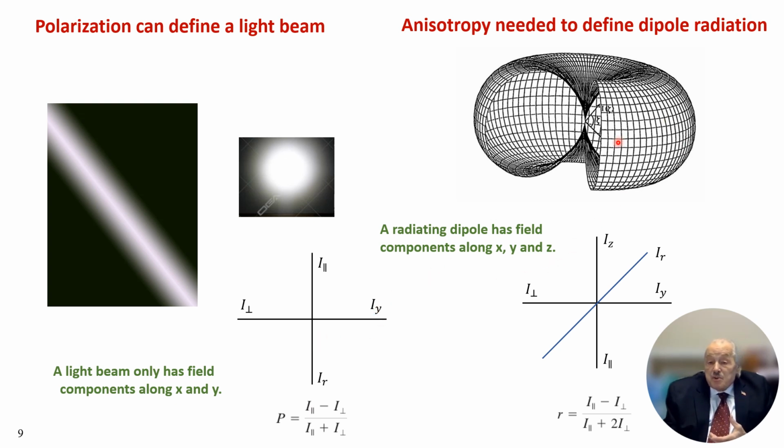But when you get to this torus, it has emission components along the x, y, and z axis. So in order to properly characterize the total emission from this, you have to sum up those components, which happens to be that term I discussed previously, I parallel plus 2I perpendicular, one parallel direction, two perpendicular directions, and hence we come up with the definition of anisotropy.